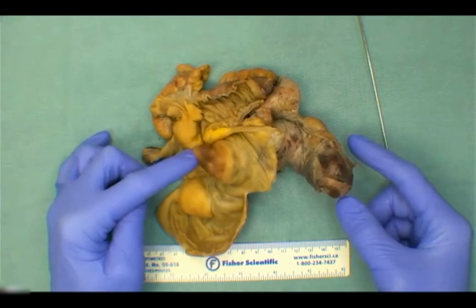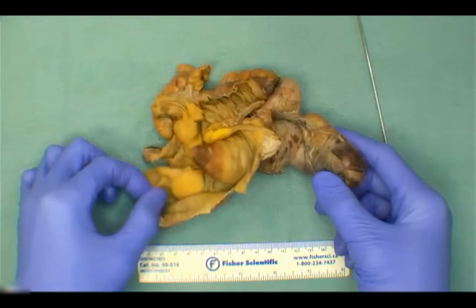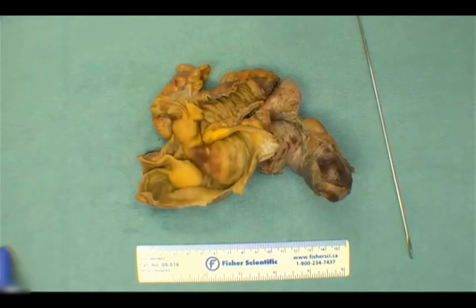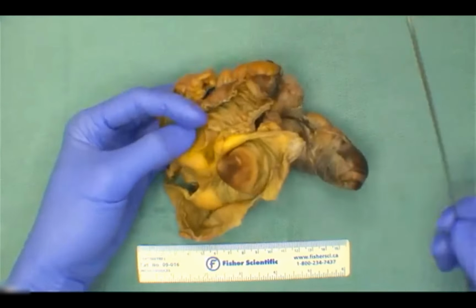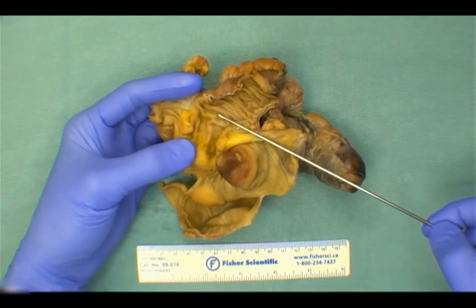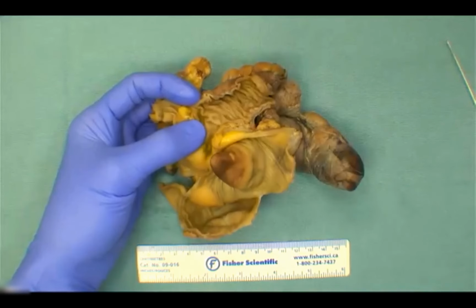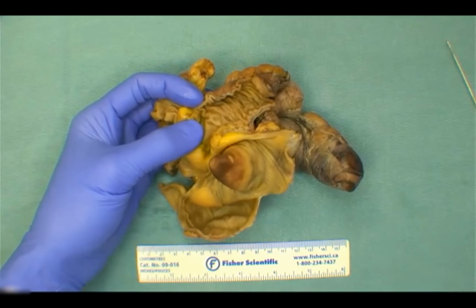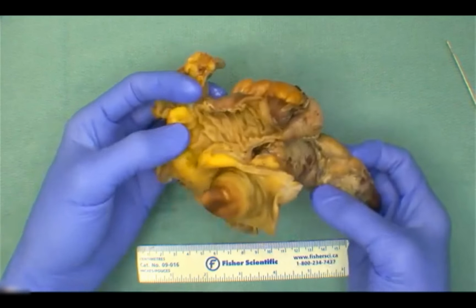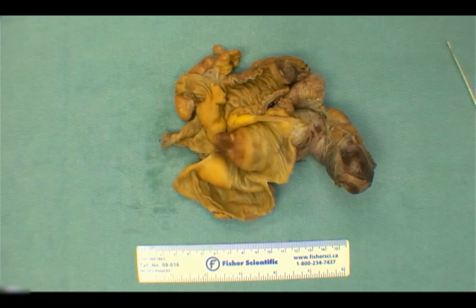The differentiating part here is it includes the ileocecal valve with the appendix and some cecum plus or minus some ascending colon. With a right hemicolectomy, typically you'll see the same structures, but you won't receive such a significant portion of the ileum. Generally, it's a very small rim, and that's a big differentiating feature between the ileocecal resection and the right hemicolectomy. If we think through some of these answers, option B, C, D, and E apply to it, thinking about what we've got here as a specimen, I think the best answer would be, okay.